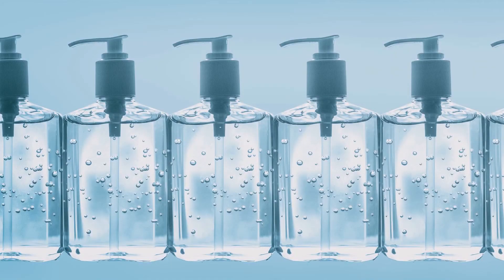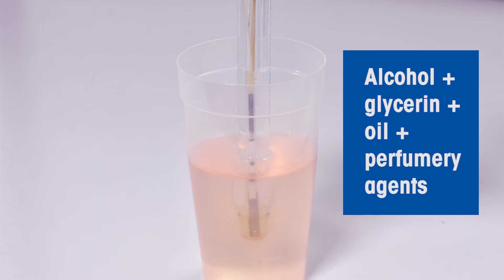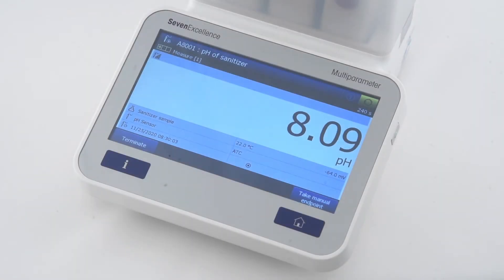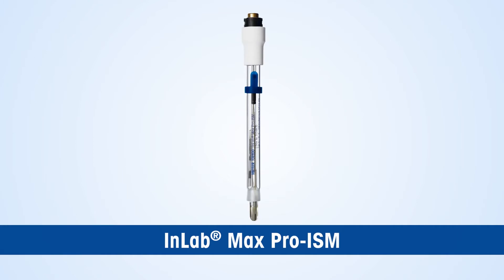Using the right pH sensor along with good measuring practices are key factors to avoid inconsistent batch quality and to save on measurement time. Common challenges when measuring the pH of hand sanitizers: due to the complex sample matrix, obtaining precise pH values becomes difficult, with longer response time due to dehydration of the pH-sensitive membrane, and the sensor shaft is prone to damage due to lack of chemical resistance.